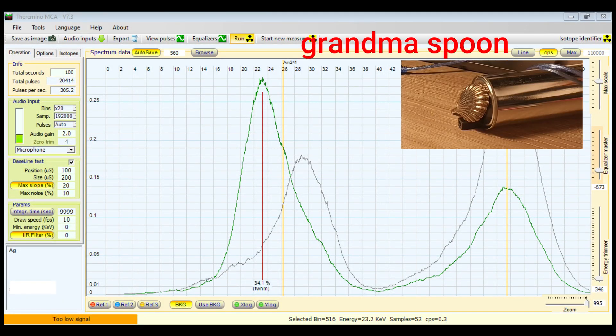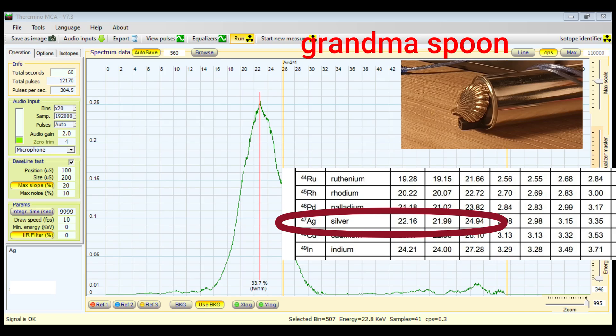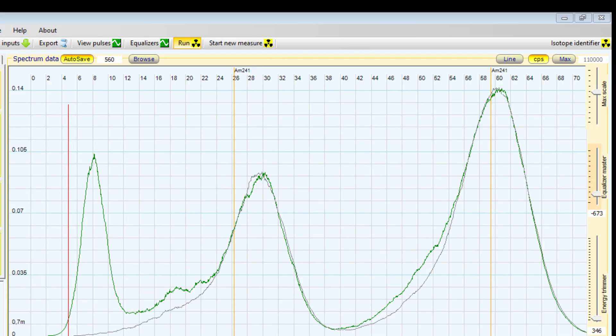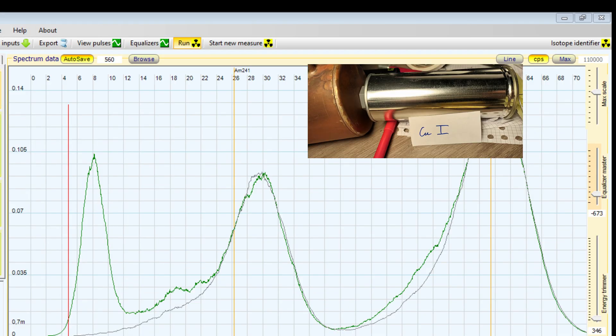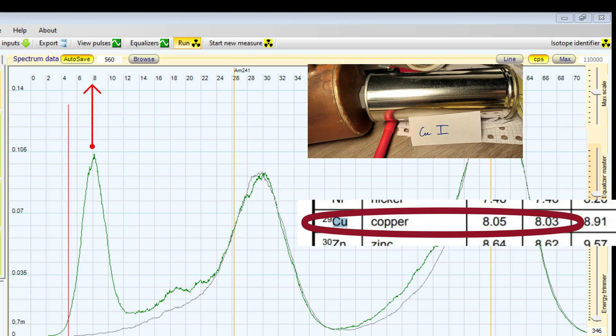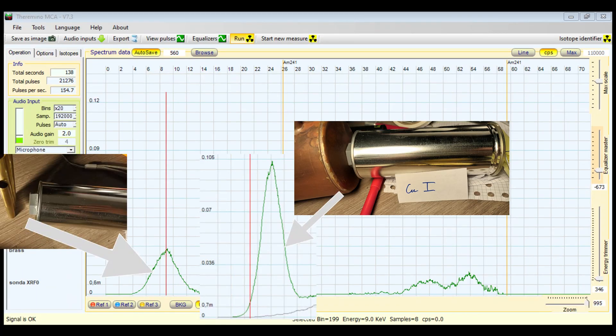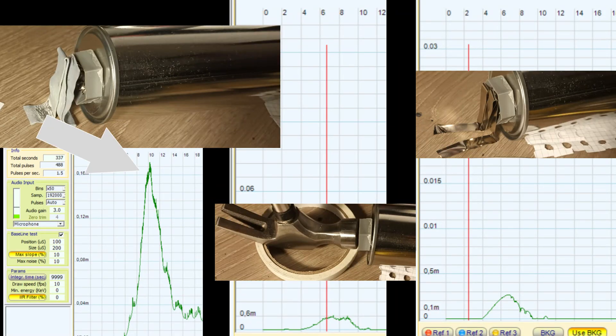Here you can see the X-ray spectrum of silver with in gray the background coming from the source and in green the measurement. By subtracting the background we can clearly see that the peak corresponds to the K-transition of silver. Here we can see the spectrum of copper coming from a simple piece of tube. We don't even need to subtract the background because the line of copper is far away from the excitation source and so it's pretty high in resolution and it's clear. If we compare this with brass we can see the wider peak due to the presence of zinc transition which are around one kilo electron volt higher in energy that makes the peak wider. And here you can see some other metals like lead, iron from a hammer and also a nickel strip.